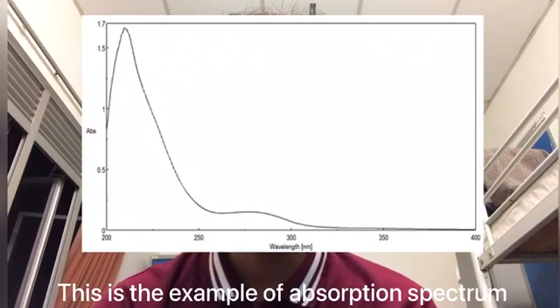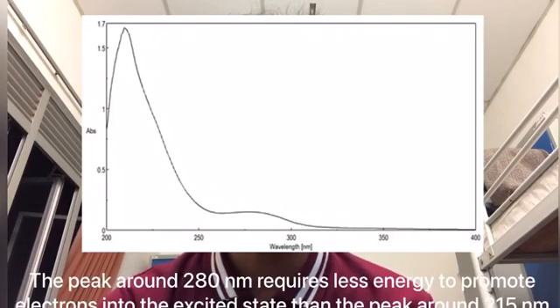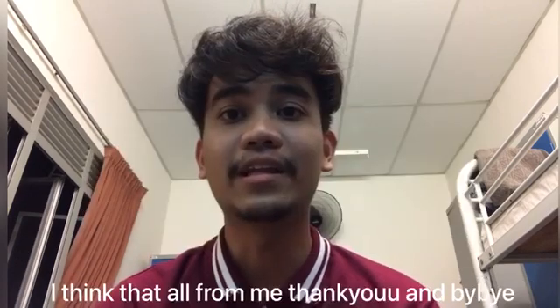This is an example of an absorption spectrum. The peak around 280 nanometers requires less energy to promote an electron into the excited state than the peak around 215 nanometers. I think that's all for me.